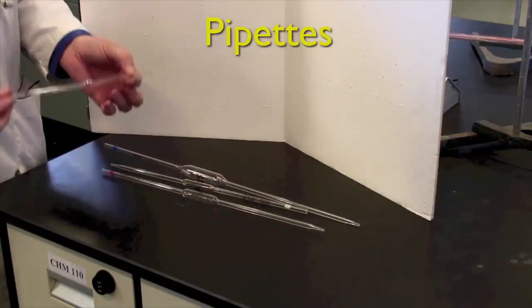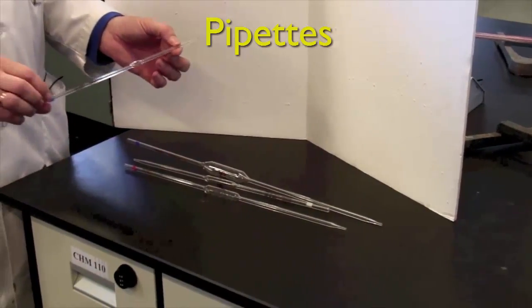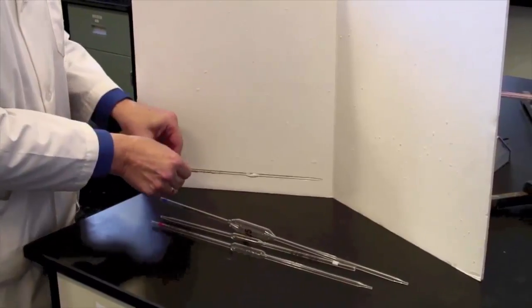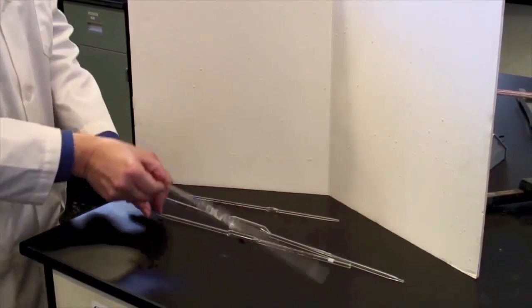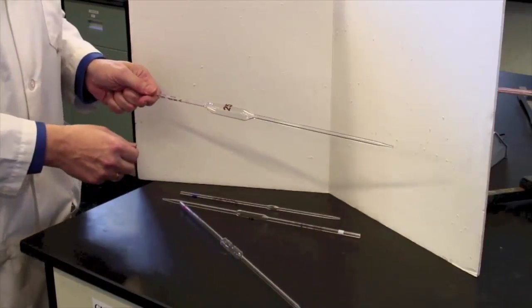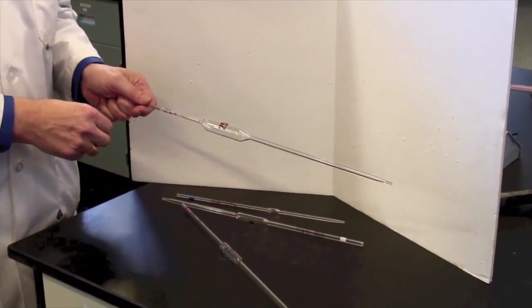For dispensing set volumes of liquid, we have volumetric pipettes. Now, they'll all be labeled on them somewhere. That's a 1 mil pipette, a 10, this is a 5 mil pipette, and here is a 25. You will have 10s and 25s available to you all the time.